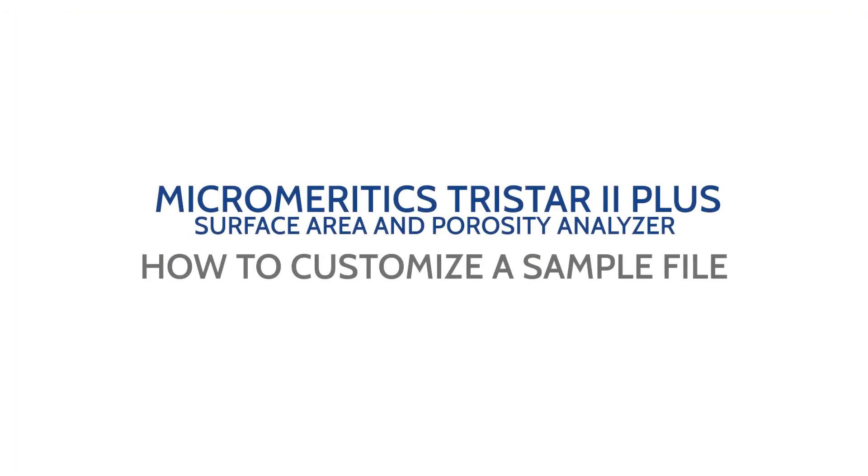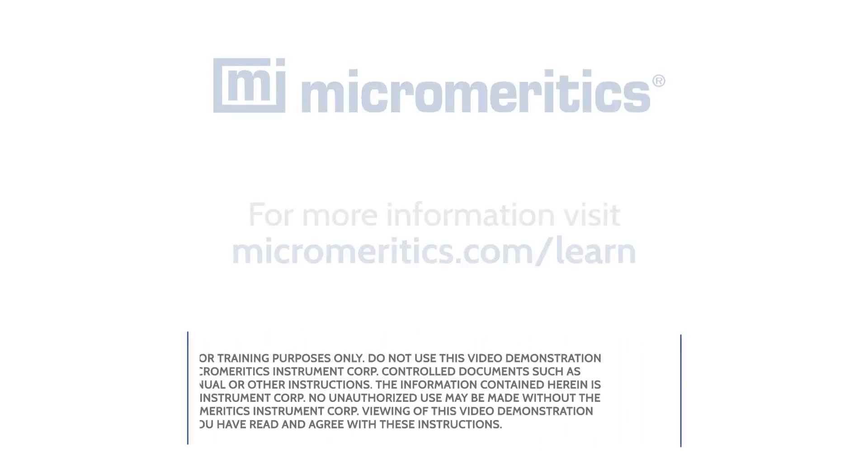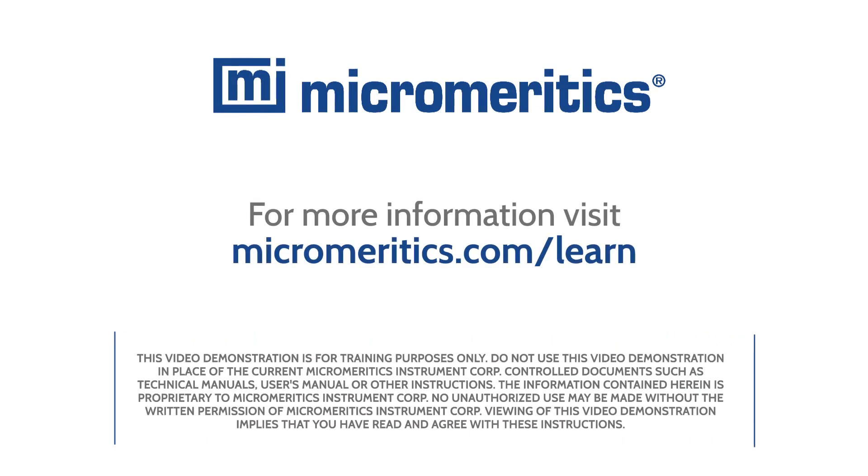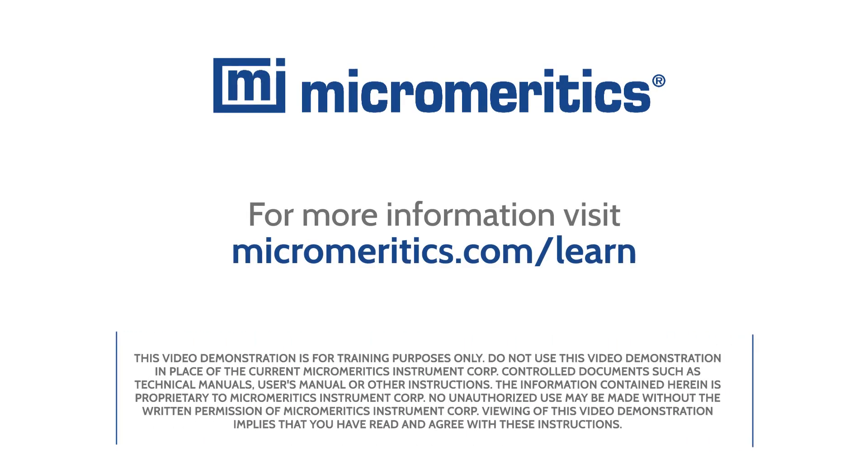Now you are ready to customize a sample file in the Micromeritics TriStar 2 Plus microactive software. For more information, visit micromeritics.com slash learn.